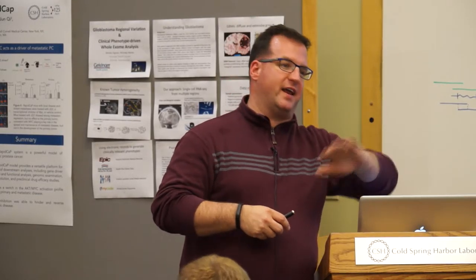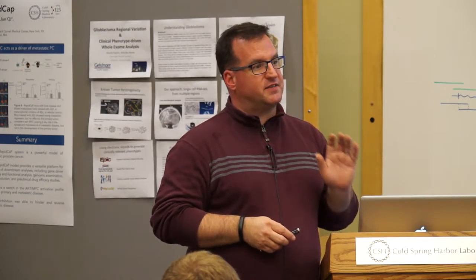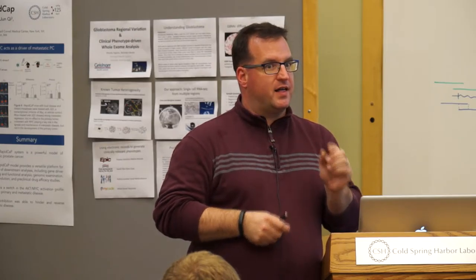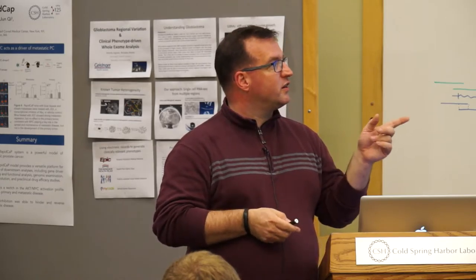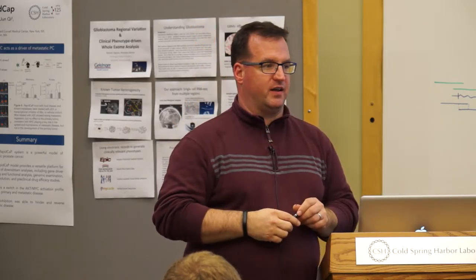So homopolymer error, 454 error, and also, just to give up the punchline, anytime I say 454, just mentally replace that with Ion Torrent, because they are the same technology. When people talk about error rates in Ion Torrent or 454, it's all about indels. It's all about homopolymers, the length of that homopolymer. The base substitution rate is very low, less than 1%. With Illumina, it's more about substitution rate and less about indels. Although there is still a possibility for indels, they are correspondingly much rarer than base substitutions.